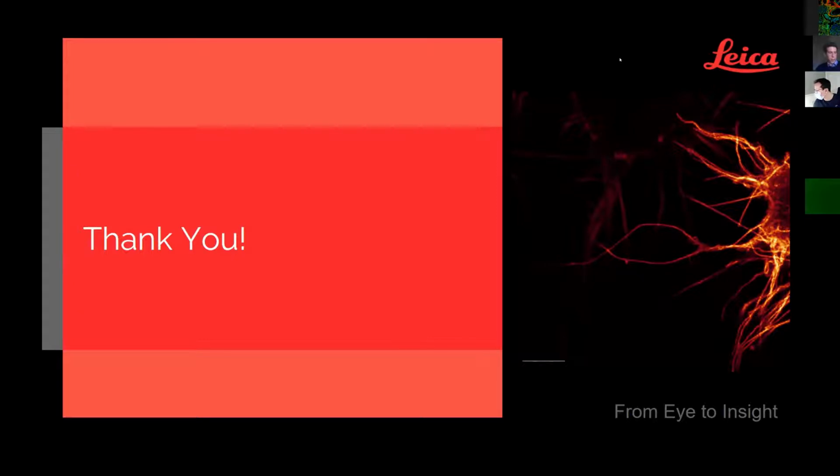Another question is: if the laser power is decreased in TauSTED, is the exposure time on the samples increased compared to usual, to get a higher resolution image? So meaning that you need to increase your pixel dwell time without STED or not, as opposed to normal STED. Let me repeat the question for myself: if the laser power is decreased, is the exposure time on the sample increased?